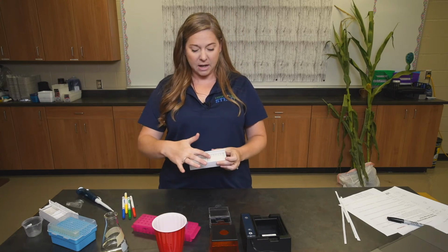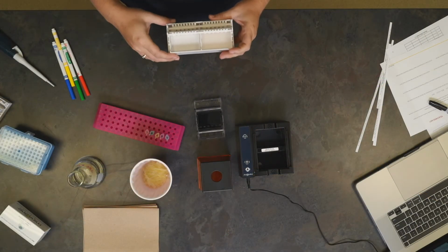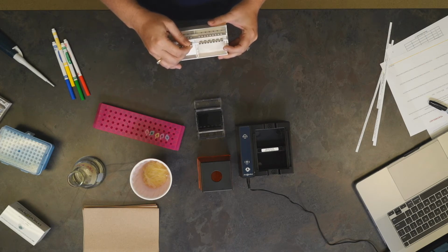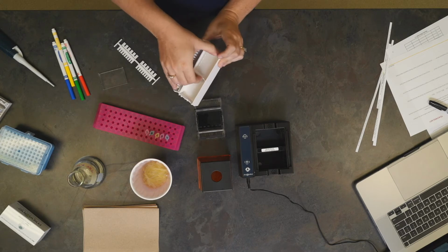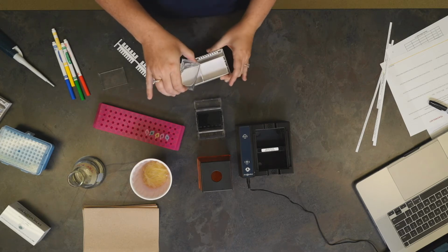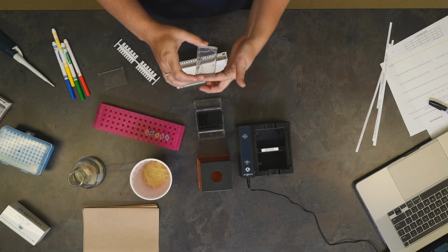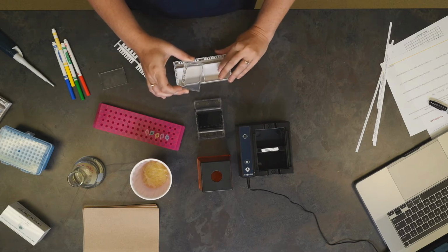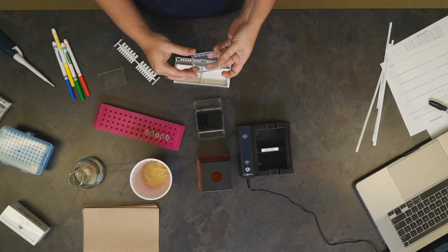So now that it's set up, I can actually tap on it and it feels like that very firm Jell-O like we've talked about before. So to release it from the mold, all I do is pull straight up on the comb and pull up on the edges of the tray. Now there may be a little of the gel that's seeped underneath, but all it takes is one quick finger swipe on either side, and you're ready to go.